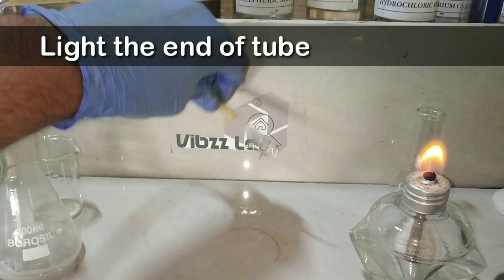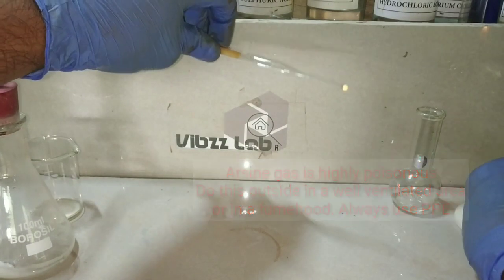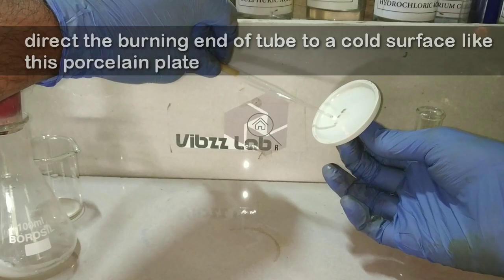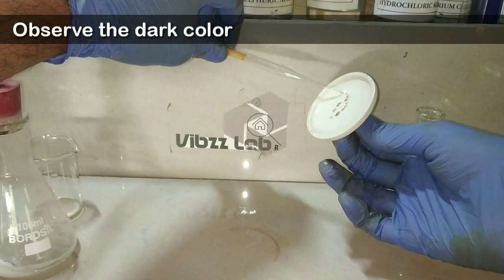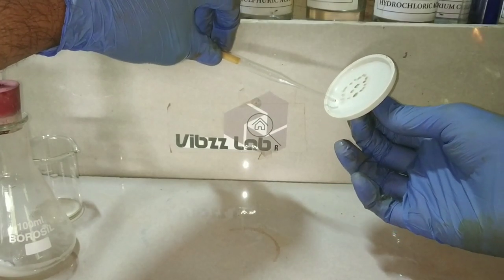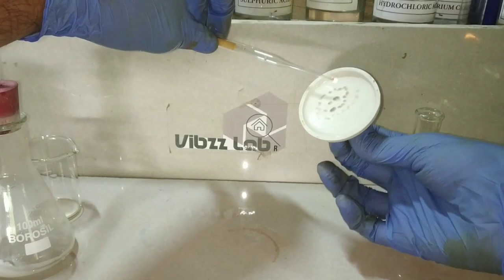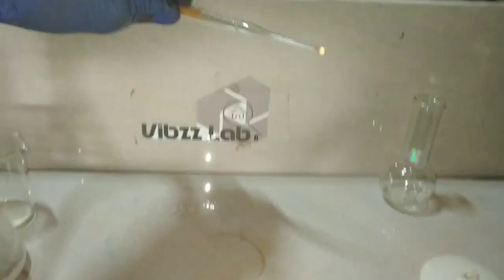Now we light the end of the tube. You can see that the arsine gas has started to burn. When you place a cold surface like a porcelain plate near the burning end of the tube, the elemental arsenic is being deposited on the porcelain surface as that dark color. This test is very sensitive and even very minute amounts of arsenic can be detected.